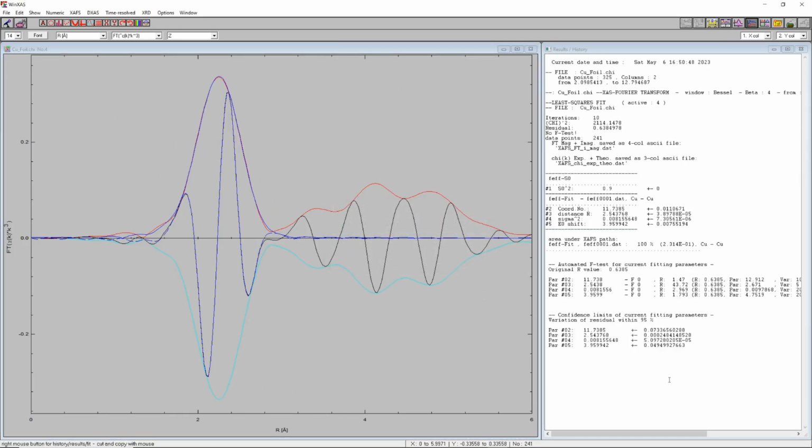And yeah, we can calculate the confidence limits now for this refinement. This should be straightforward, and we see we have low confidence limits here, so a narrow confidence band, if you wish, and this indicates reliable structure parameters, some correlations, but nothing major, so basically independent parameters with good confidence limits.